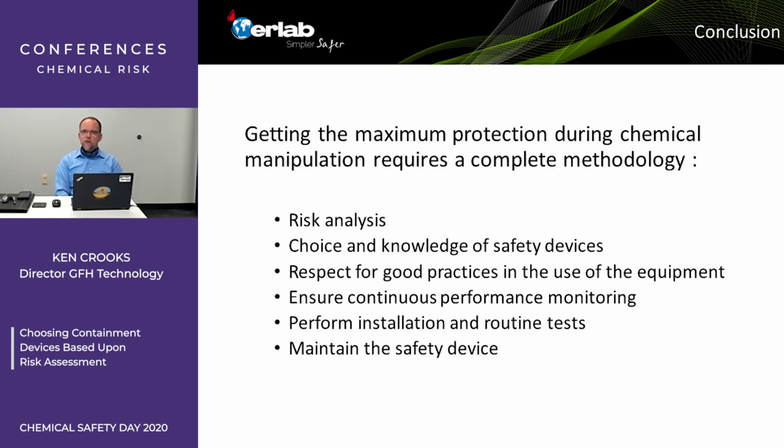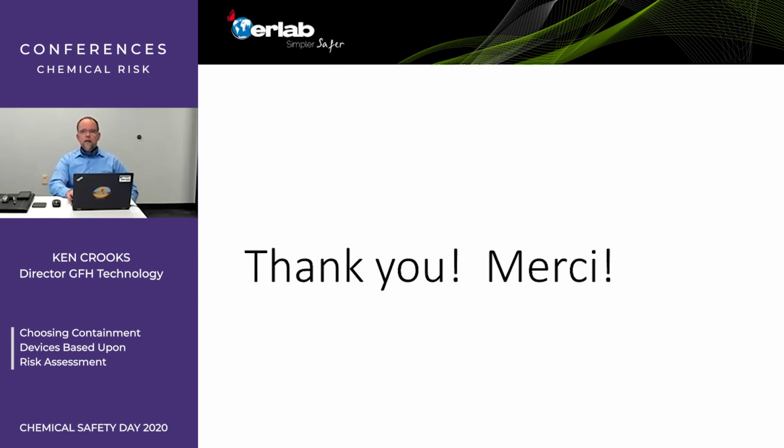That comes back to those administrative controls and making sure that that risk assessment is understood and the training program is there for new users and continual retraining. If the users of fume hoods are like me, they tend to forget things over time if they don't do it continuously. Monitor that equipment, inspect that equipment, maintain that equipment continually, and then obviously at least every year have a third-party inspection of each of your containment devices and certify that. And depending upon the risk, you may want to and need to do that more often. In some cases, the extreme case, before each use. And that's really up to the individual situation. And that's it for me today.